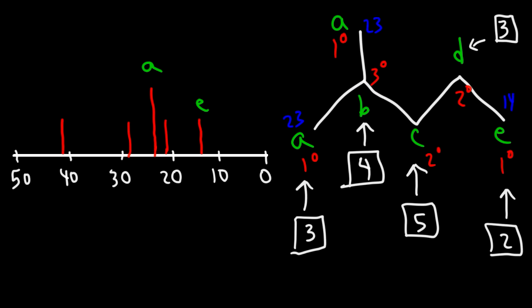Now, which one do you think is the one with a signal of 42? This is going to be carbon C because it has the highest score value of 5. Next up is carbon B because it has a score value of 4. And then by default, this has to be carbon D.